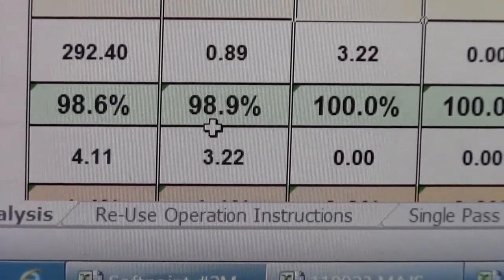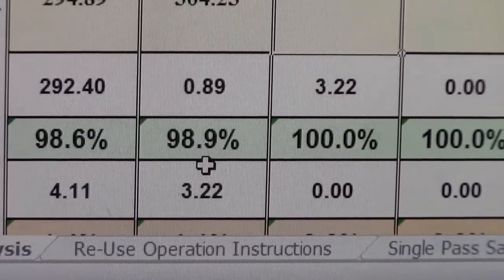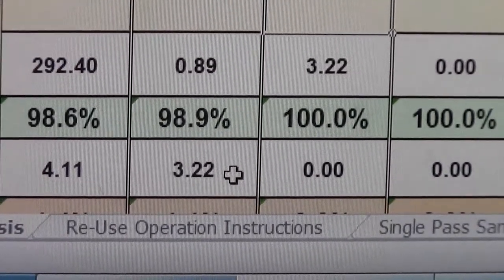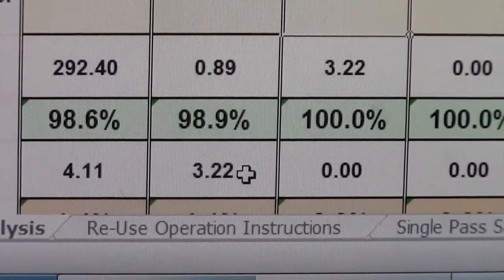The material was then transferred to the 125 micron screen, and as you can see, 3.22 grams of the material was retained.